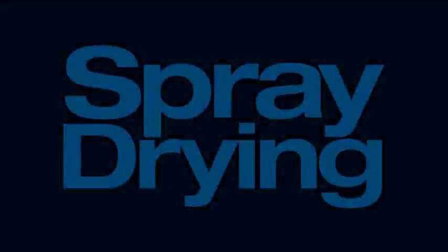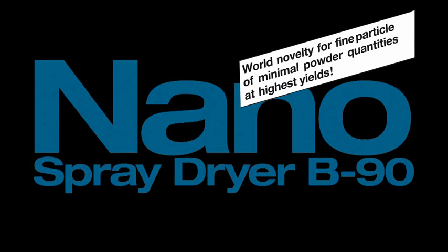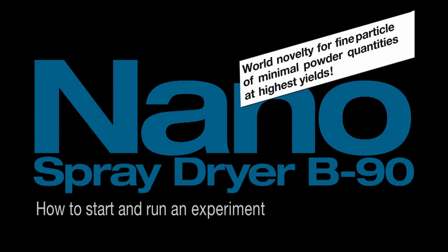The Nano Spray Dryer B90, a world novelty for fine particles of minimal powder quantities at high yields. How to start and run an experiment.